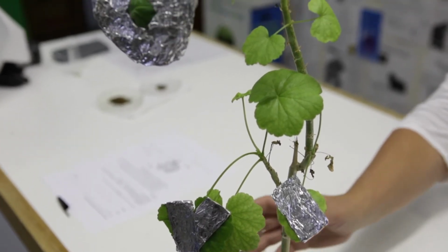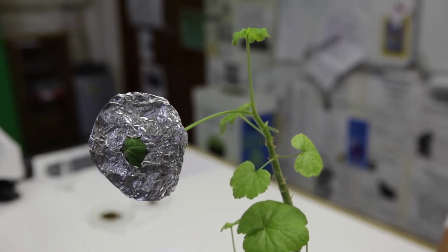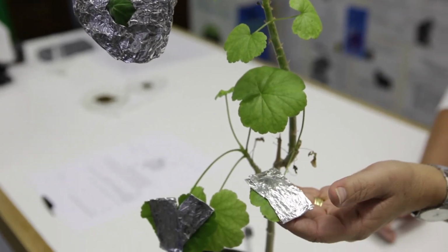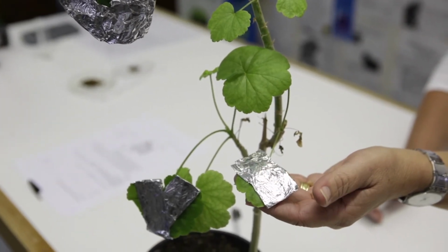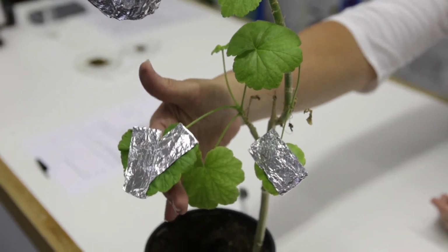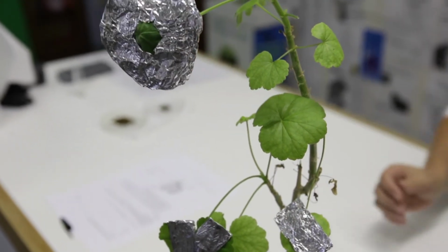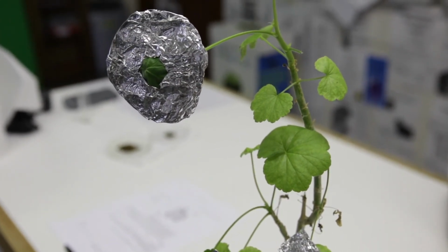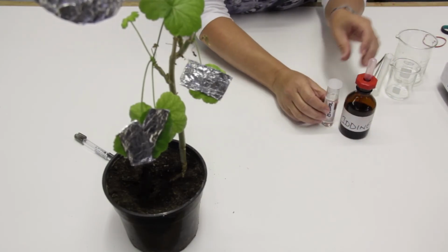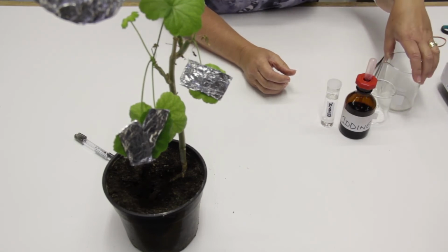hours. And you will see that we have now placed foil over parts of the leaf, blocking out light under the foil. You can decide exactly what pattern you would like to make. What you would also need is all the apparatus that you have used previously to test for the presence of starch in a green leaf.